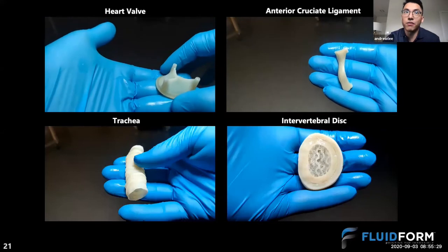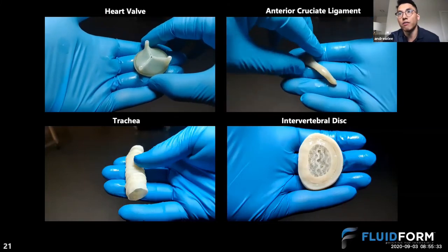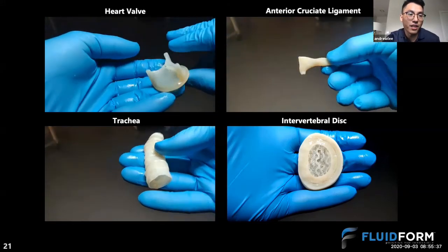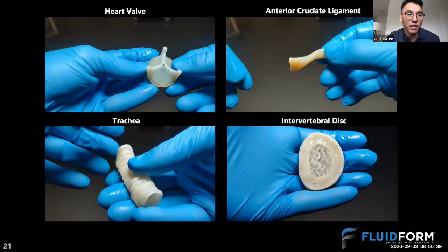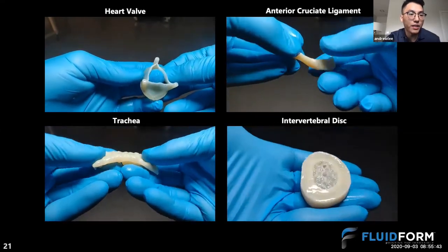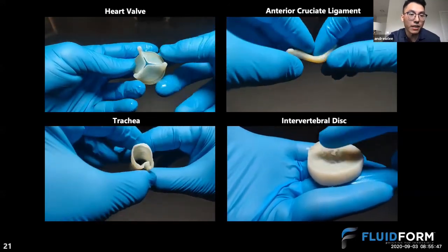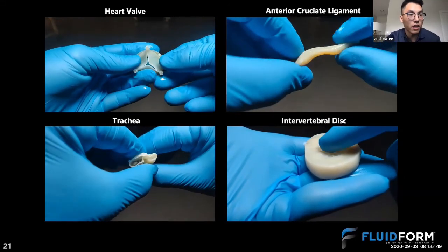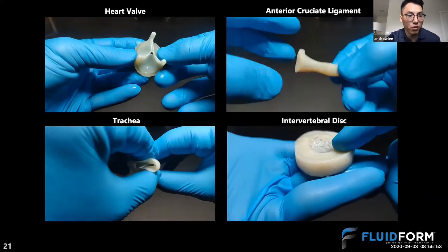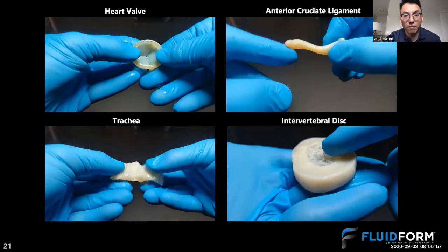The ACL is, of course, a very common injury site for athletes and just for everyday folks like us. And then the trachea, as well as the intervertebral disc for spinal injuries. In all of these examples, you can see that these can be handled. They maintain their desired functions, and the regions on these prints can be controlled for stiffness and structure, so that they can eventually lend to function.